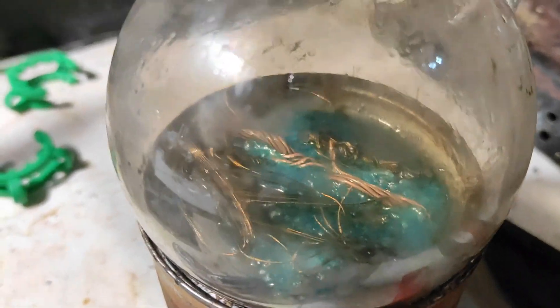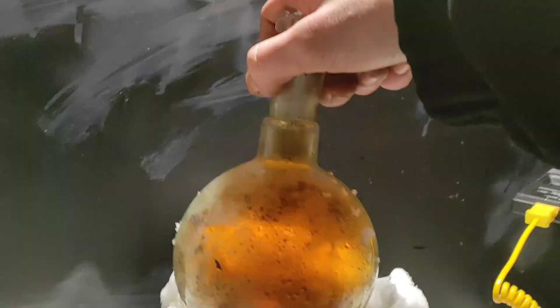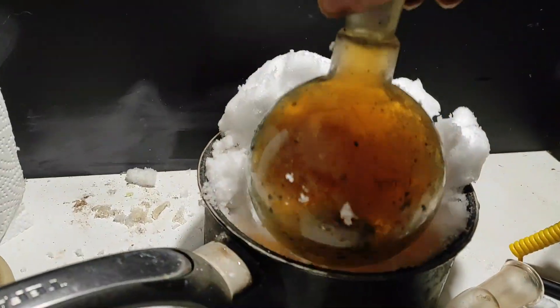I'm going to use this copper nitrate in another video, or maybe stockpile it. And here — look at this under the light — this is a dinitrogen trioxide. And if we pass some oxygen through it, we can get the NO2 liquid, sorry.